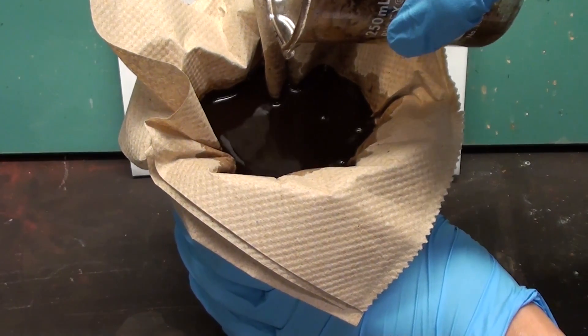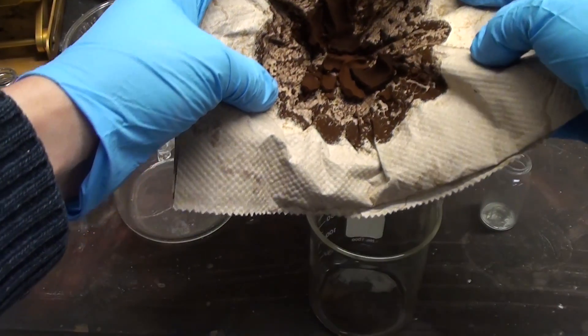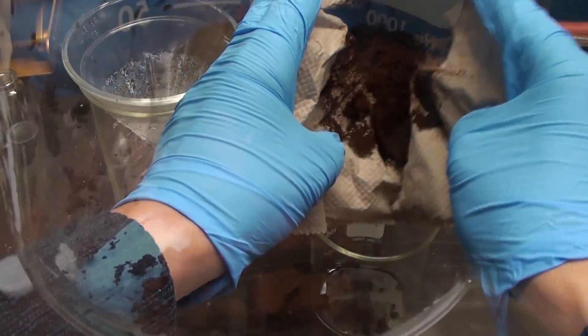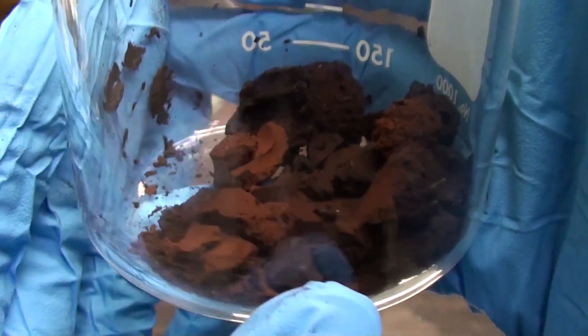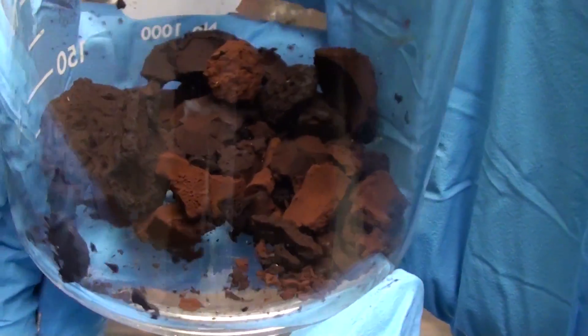Let the filter dry for about a day. Here we are the next day — the manganese dioxide is much drier and can be easily removed from the filter. Place it into a beaker and let it dry before crushing it into a powder. I recommend using an oven set to about 130 Celsius.